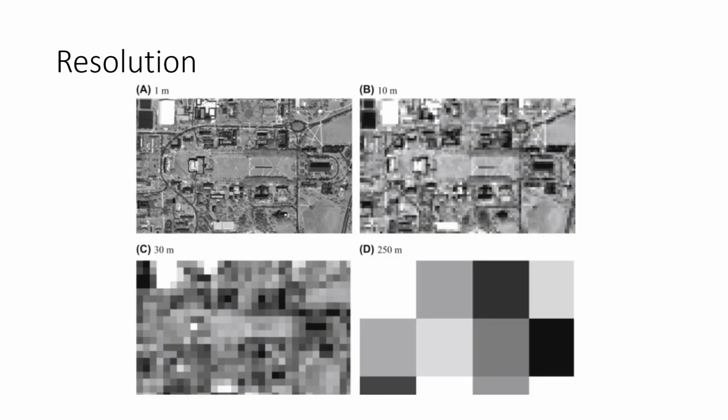So this brings us to the topic of resolution. Resolution is what we aim for, a greater resolution. What is resolution? Resolution is the minimum distance between two separated points. So we have two separate points, and the distance between them is what defines the resolution. We want highly resolved images.